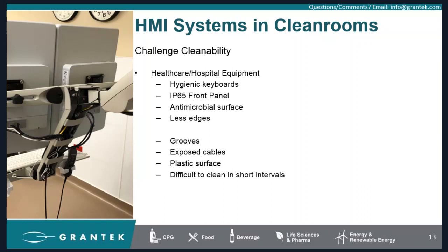And if you take a look at that picture, the mounting arrangement is actually quite nice, I have to say that, but with the cables being exposed and running really wild, you would not want to be the person who cleans that. And if you have to be the person that cleans it, you will spend a lot of time going through each and every cable, wiping it down, cleaning it properly, putting it back together. So from an operational standpoint, that really is a nightmare.